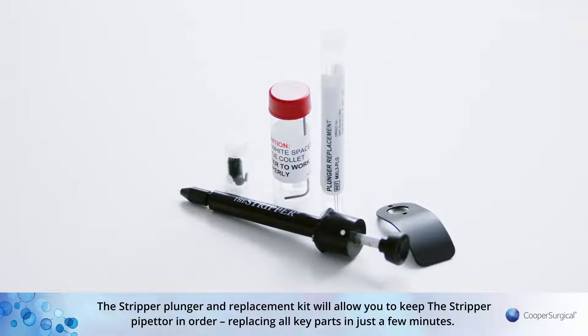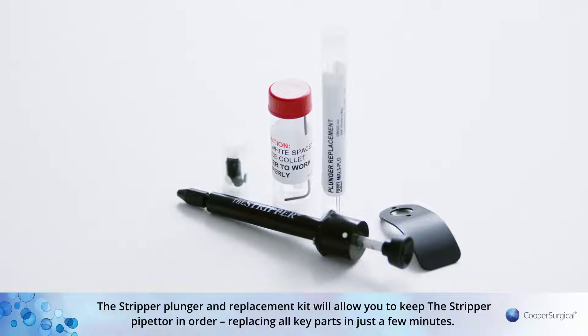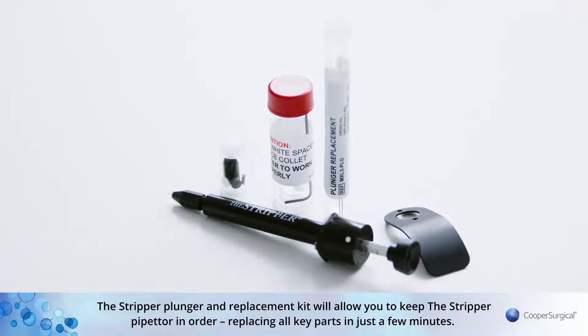The Stripper Plunger and Replacement Kit will allow you to keep the Stripper Pipetta in order, replacing all key parts in just a few minutes.